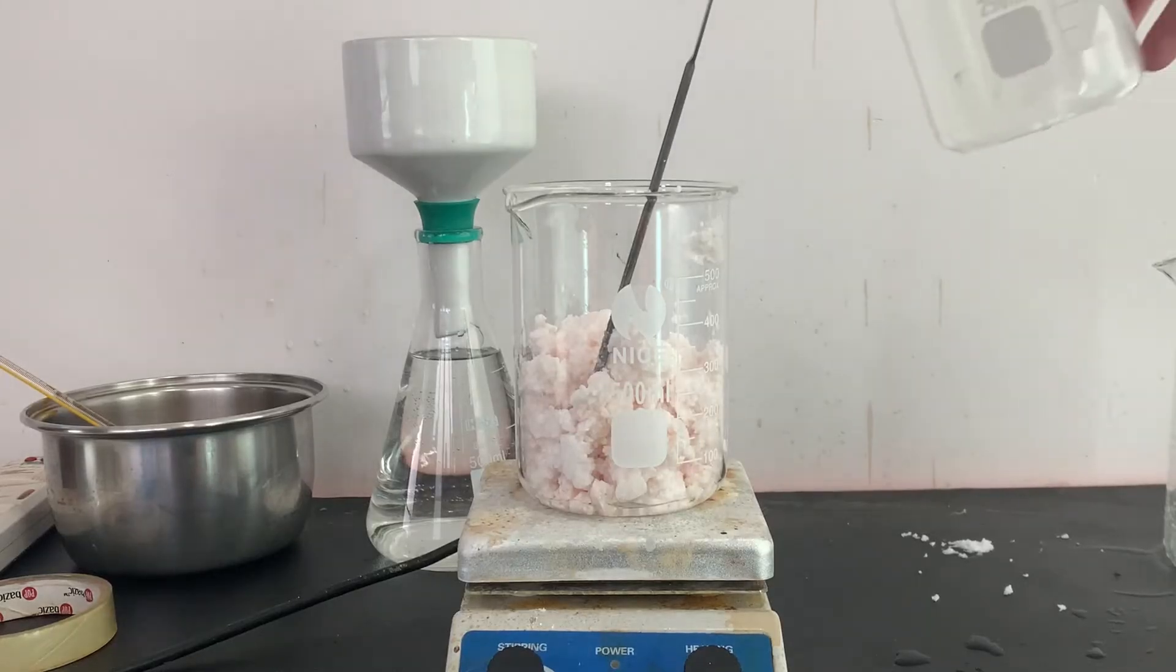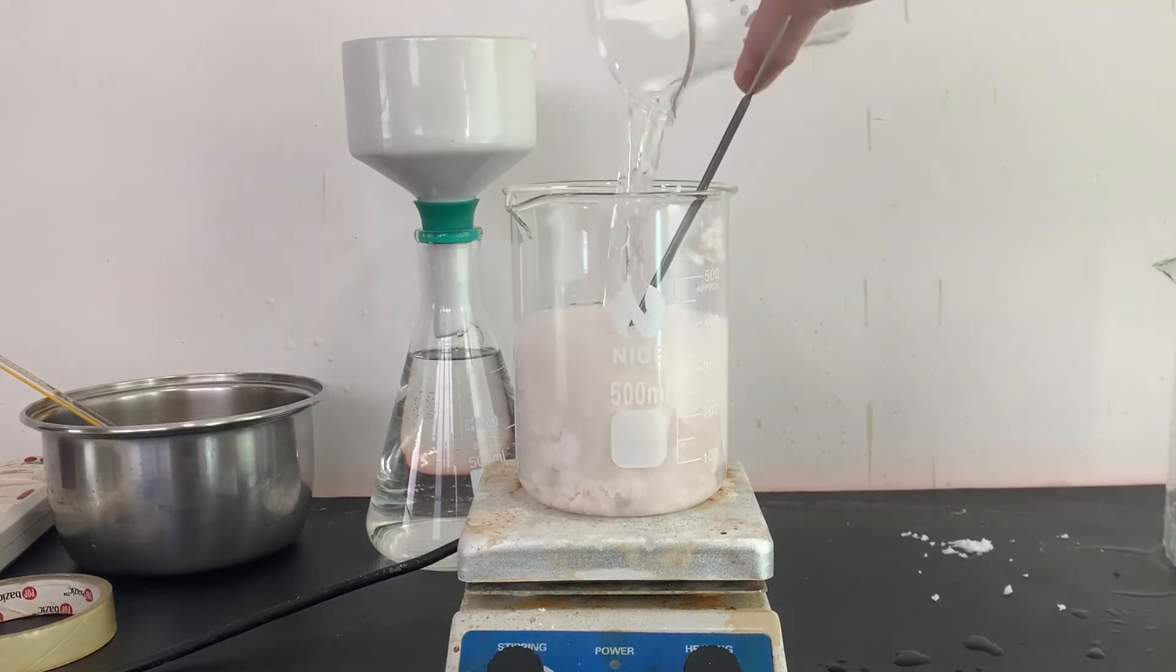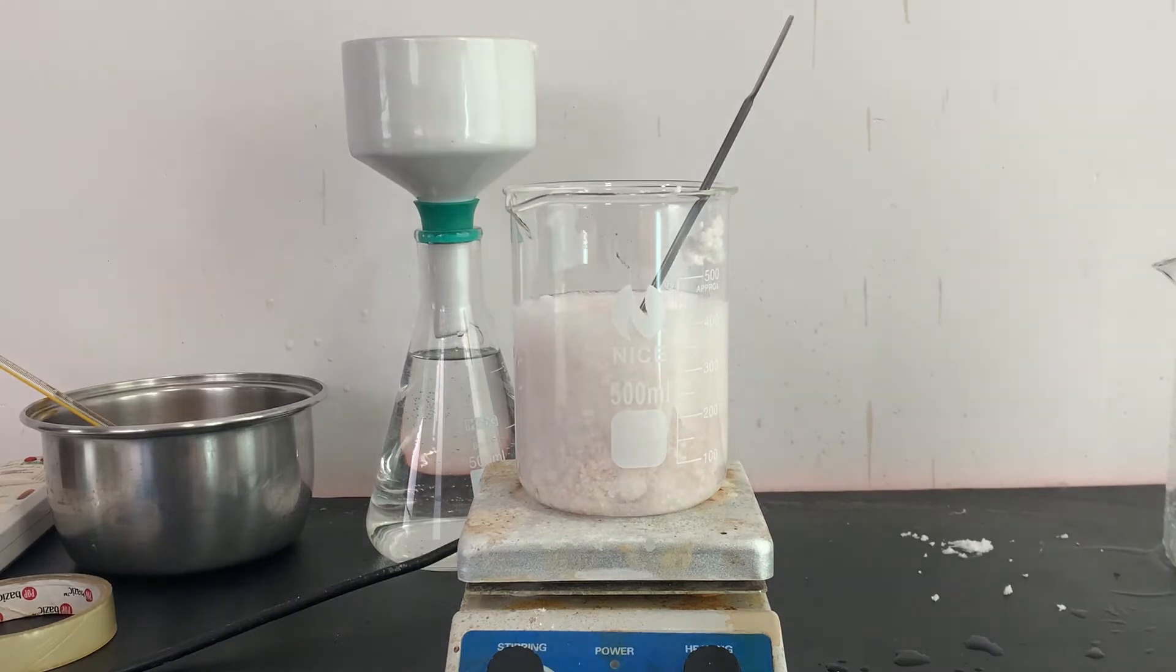I then vacuum filtered the acetanilide to separate it and transferred it to a 500 ml beaker. I will then purify the crude product by recrystallization.